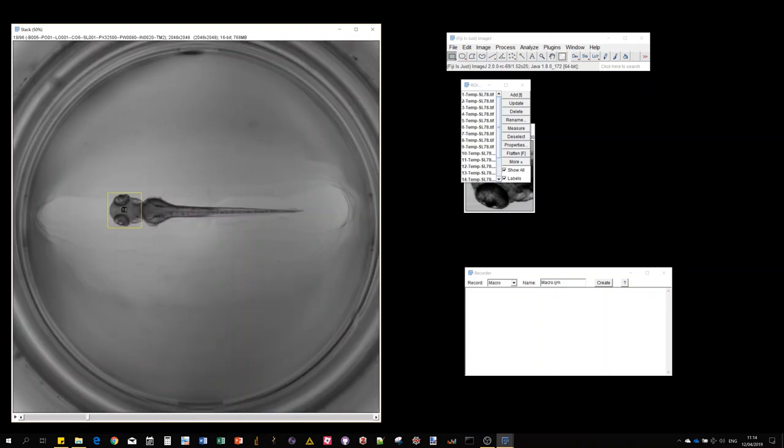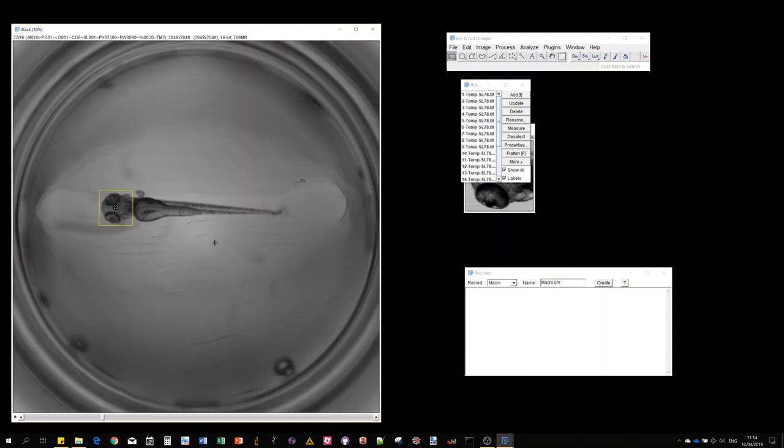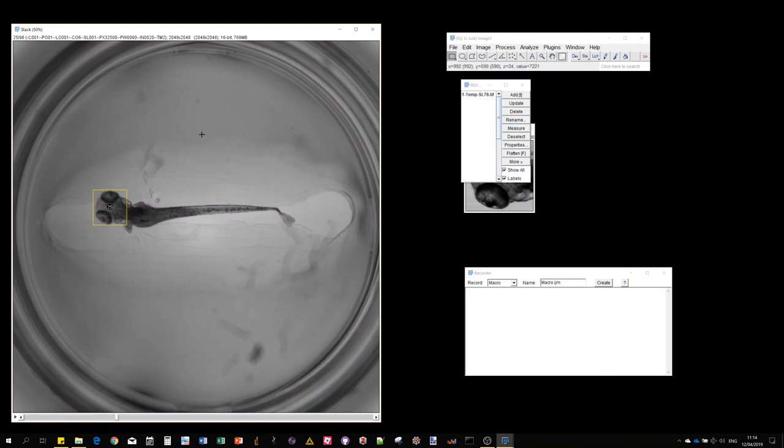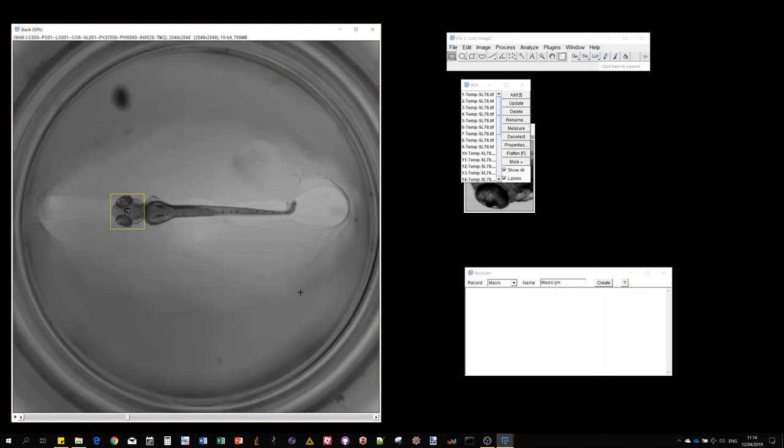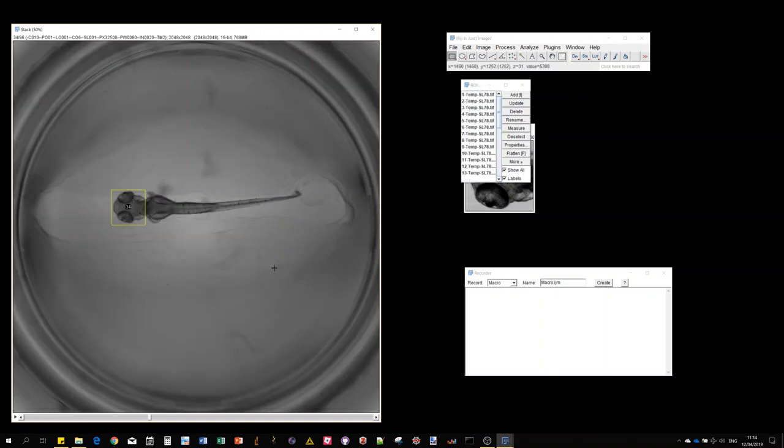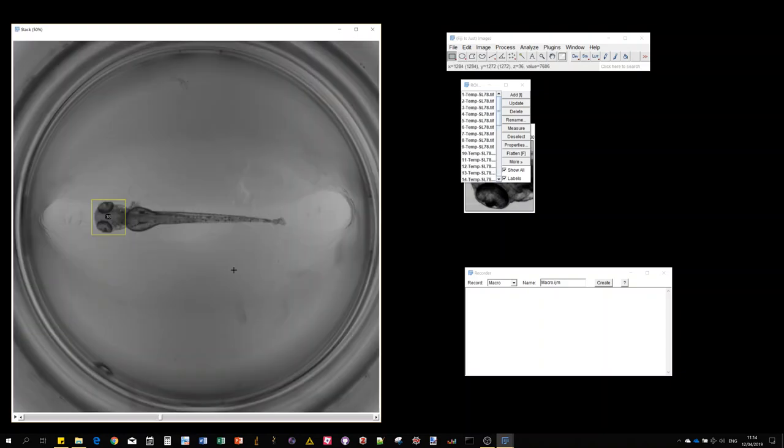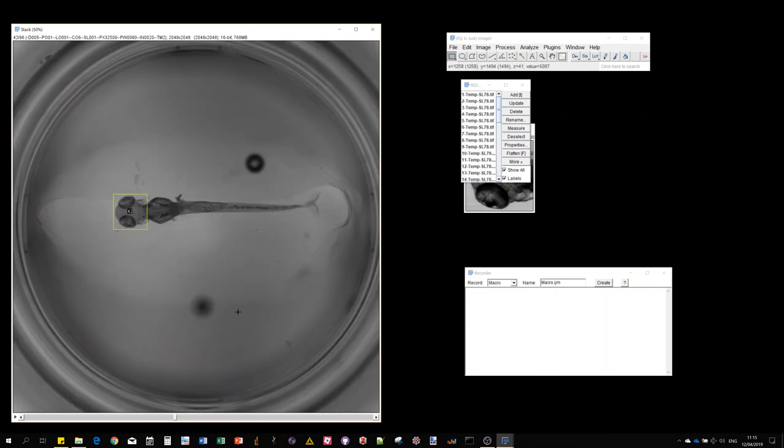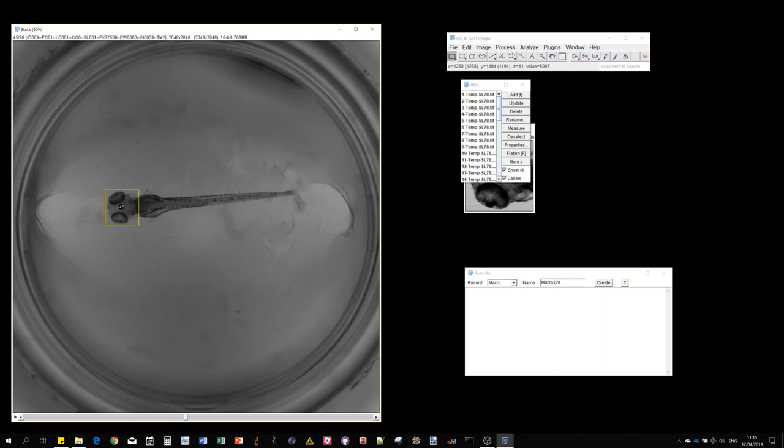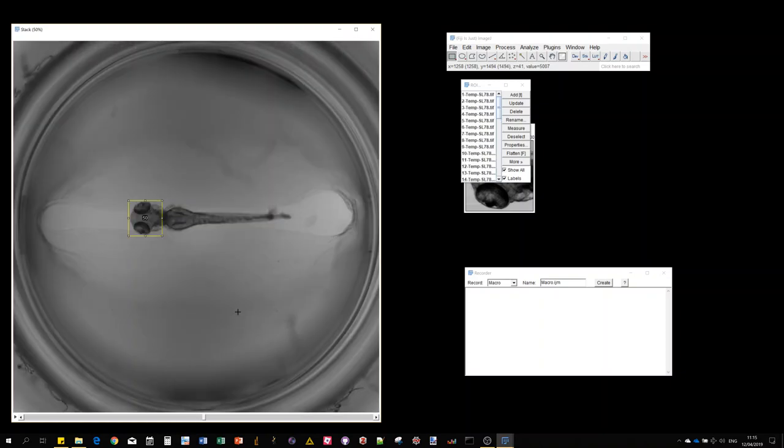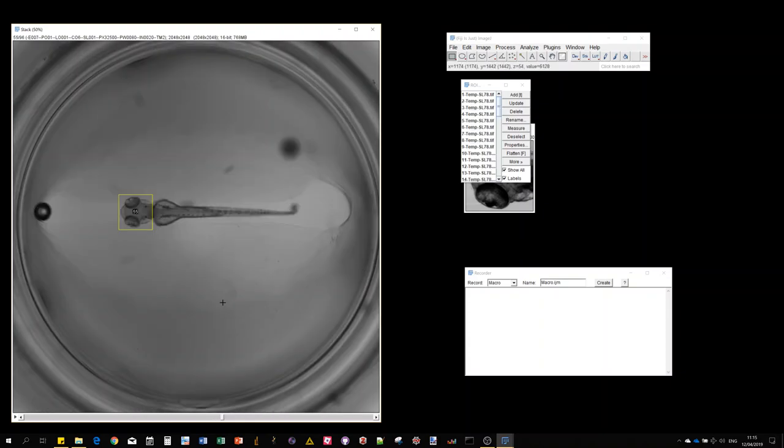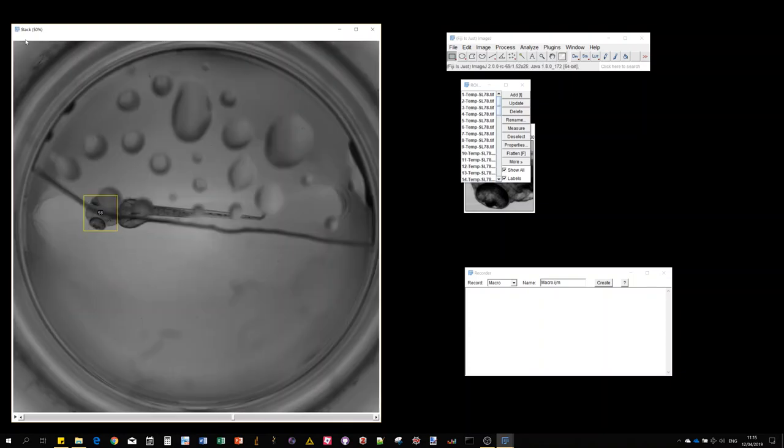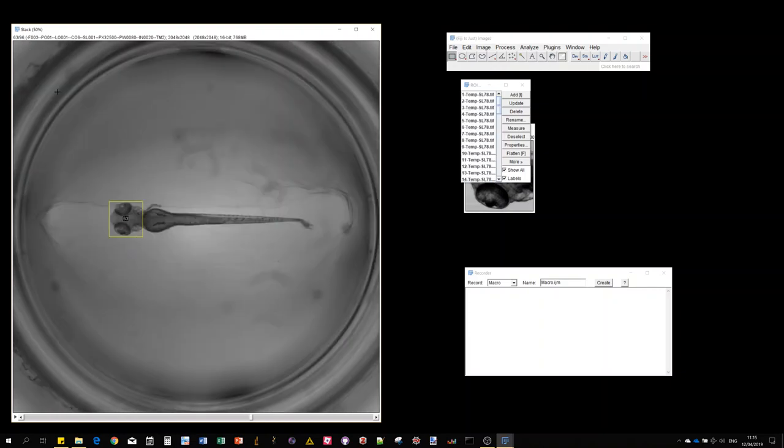As you can see, even though we have quite some variability in the image - changes of morphology, dust, or bubbles - the template matching method is actually quite robust for this particular case. If you would do it by segmentation, you would have to filter out those bubbles and everything, which requires much more engineering compared to this more universal object localization method. We are about halfway through processing the 96 images from the well plate screening.